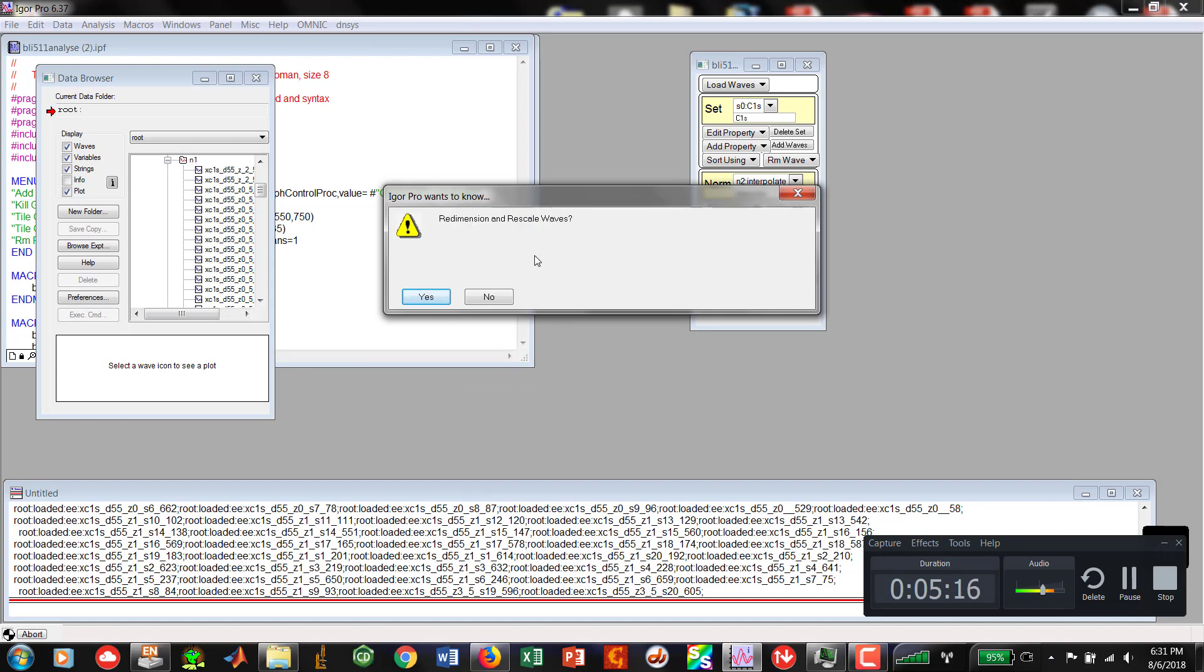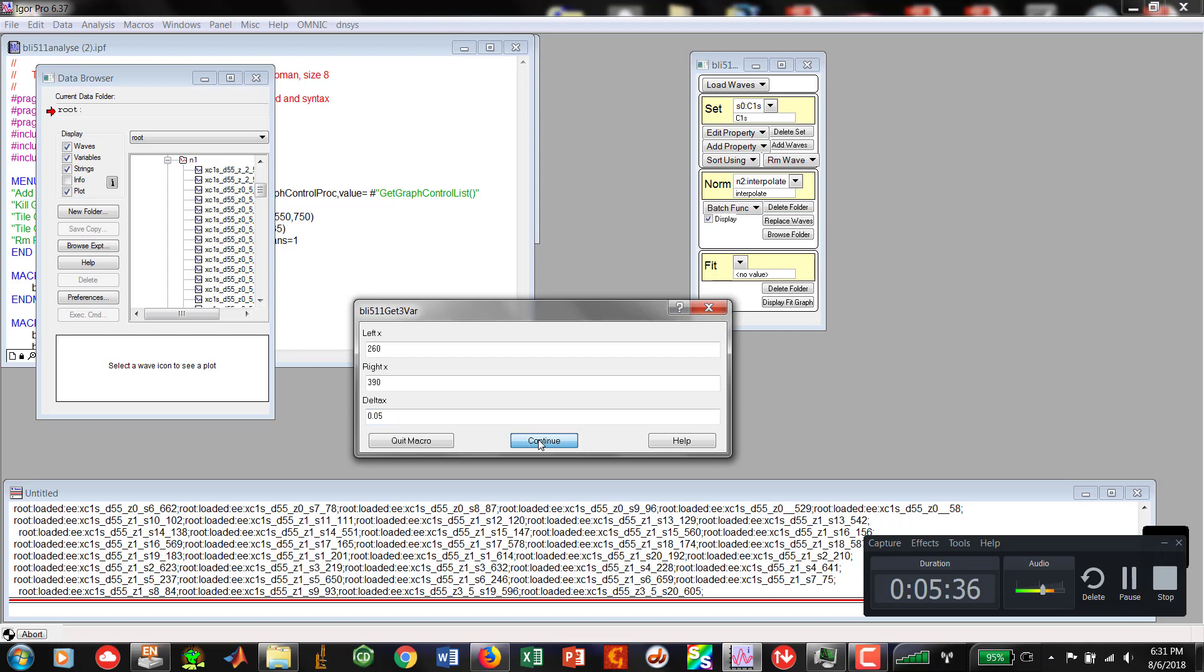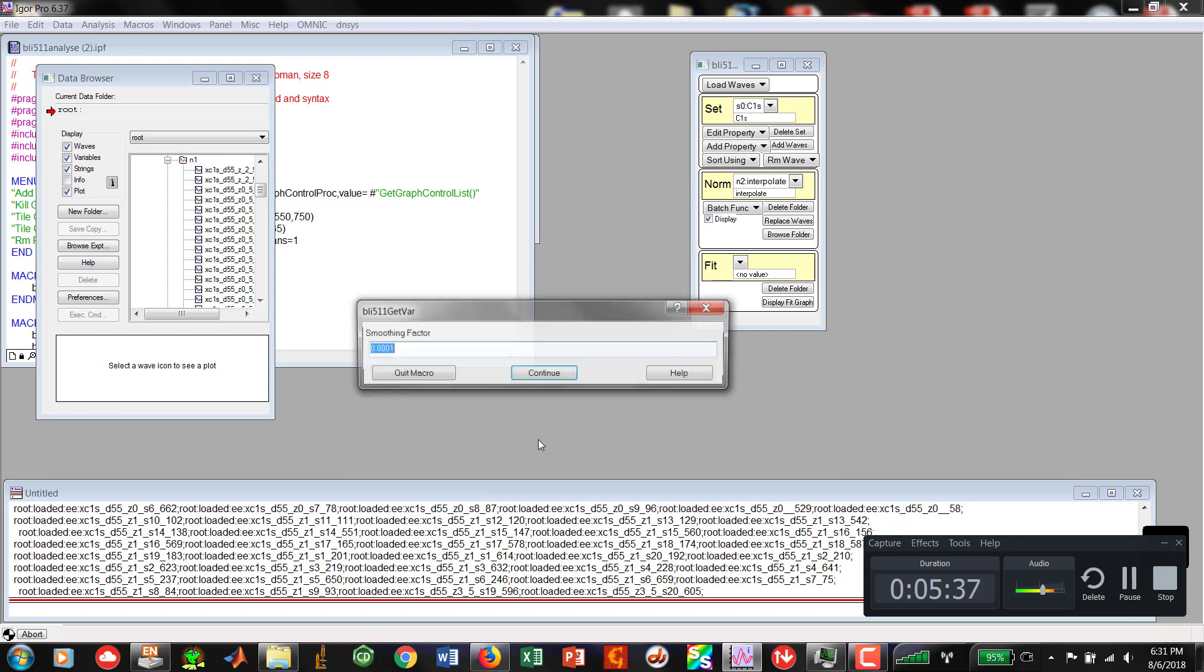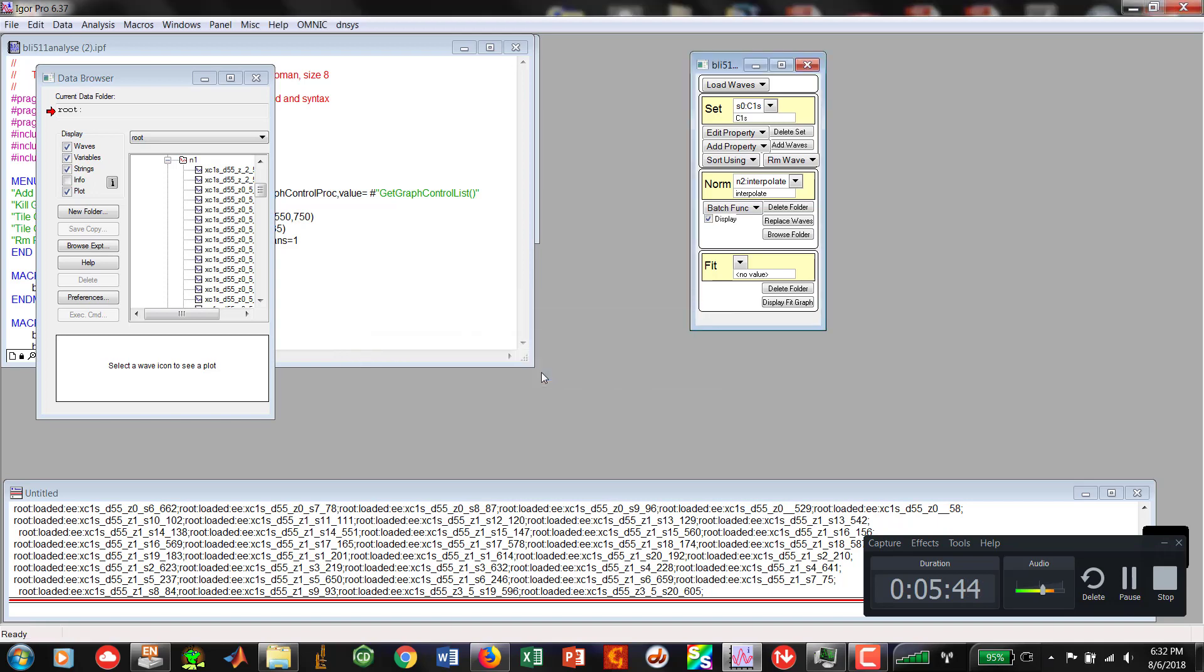We hit Continue. Redimension and rescale waves. Yes. Use same scaling for all waves. Yes. We're going from 260 for carbon to 390. You can also check that is obviously different for nitrogen, boron or oxygen. And we can look at the waves to do that later. But this is for carbon. We're going to hit Continue. Smoothing factor we'll leave in there. We're going to do a linear interpolation. So that's one. Hit Continue. And our work has been done.